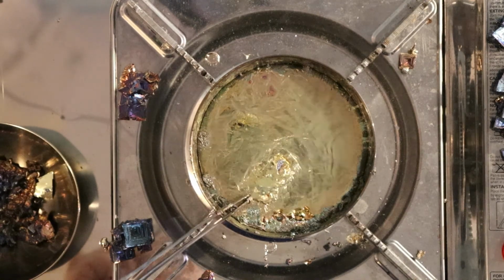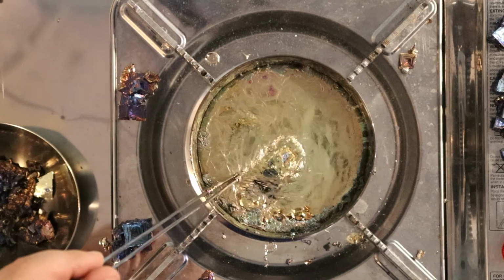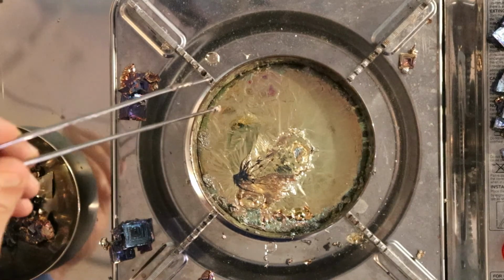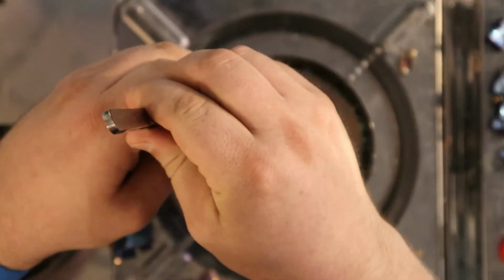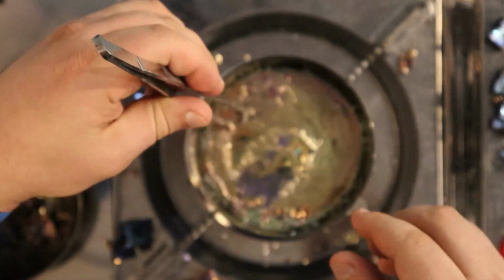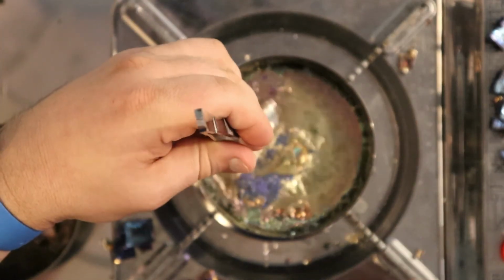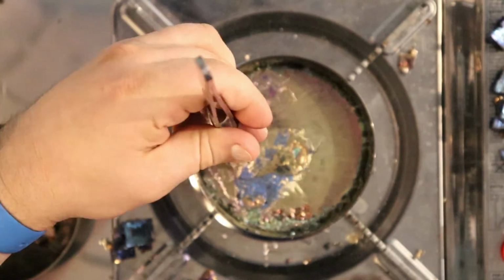This crystal is fairly large. Picked up a passenger on the side. This one is going to run into stuff. So even though it's a fun trapezoid friend, I'm going to remove it from this corner if I can. Maybe not. Okay, have to go from another side. Oh, it's very thin and spindly and kind of got away from me.